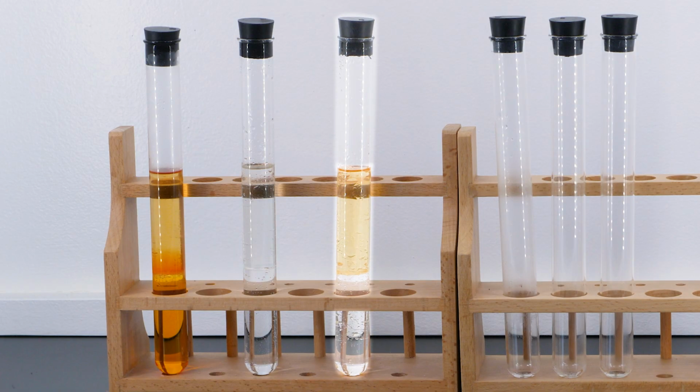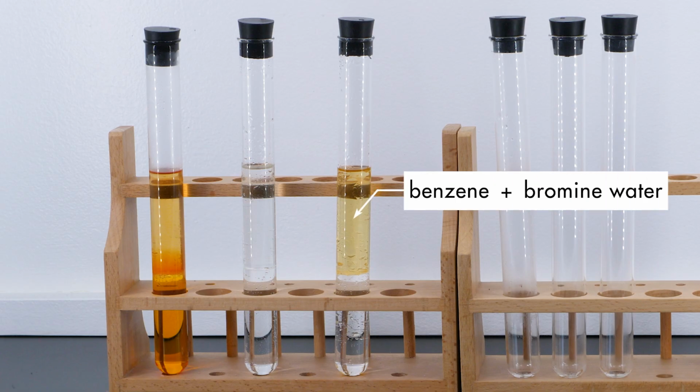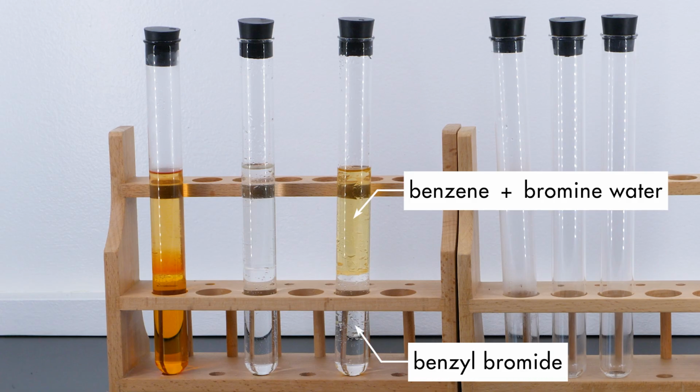Finally, we check the test tube containing benzene and bromine water. As with the other two hydrocarbons, the contents of the test tube containing benzene and bromine water separated into two layers. The top layer is a mixture of benzene and bromine water. Under bright lights, benzene reacted with bromine water to produce a cloudy, colorless compound named benzyl bromide, which settled to the bottom of the test tube.